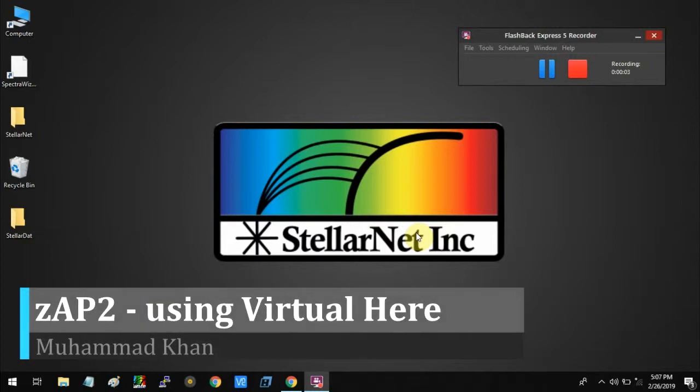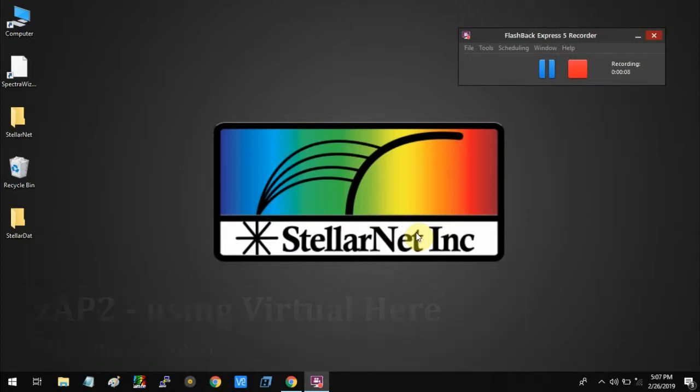Hello everyone. Today I'm going to show you how to connect your ZEP2 spectrometer to your SpectraWay software using VirtualHear. VirtualHear is a software that converts or sends the USB data over Wi-Fi.